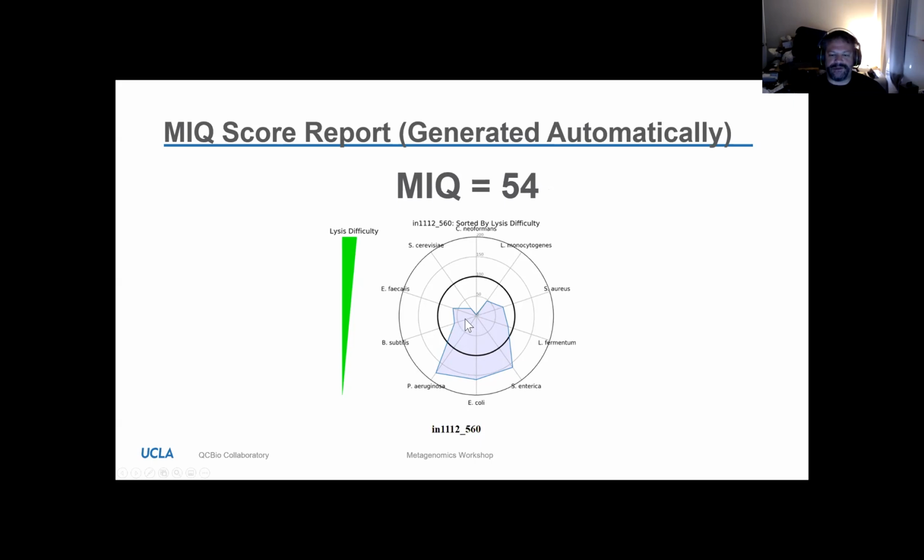And when I show the pipeline, it'll be obvious these are ASVs because these are actually being run by an automated DADA2 pipeline. Again, Cryptococcus is also missing here. Not surprising because we have a lysis bias, and Cryptococcus has about the hardest shell in the bunch.